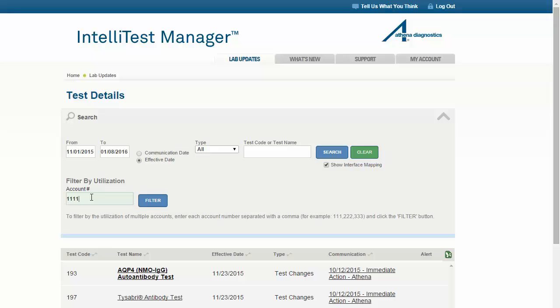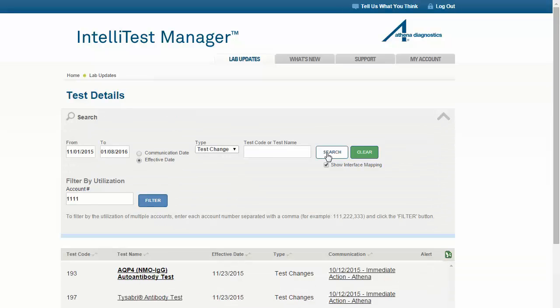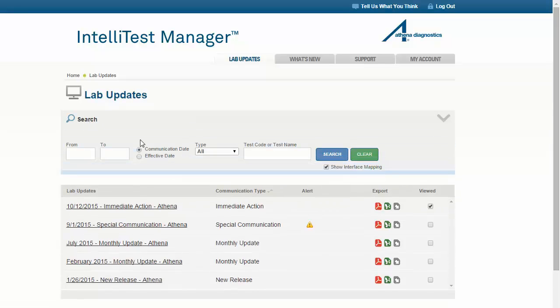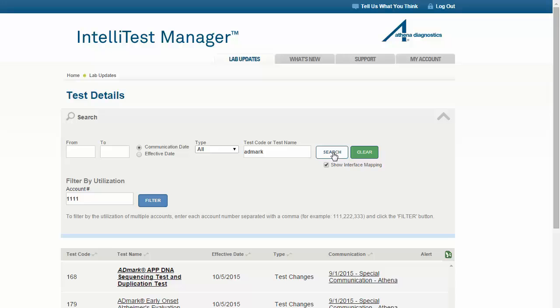You may use the other search fields in conjunction with a date range or without one. For instance, if you are interested in viewing all communications of a particular type that fall into this date range, select the type here and click Search. Or, if you want to locate a communication regarding a particular test, you can clear all of the other fields, then type only the test code or test name in this field and click Search. If you utilize an interface, you can select the Show Interface Mapping checkbox to include interface mapping information such as result codes and result names when viewing, printing, or exporting information.